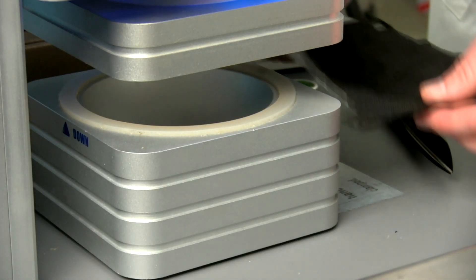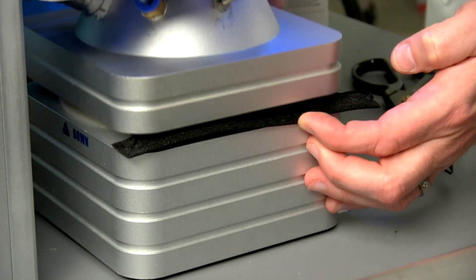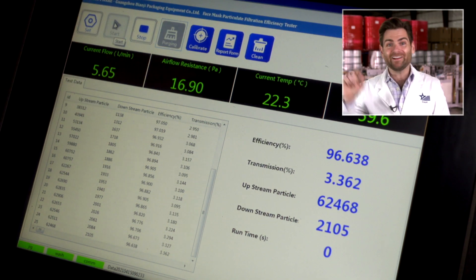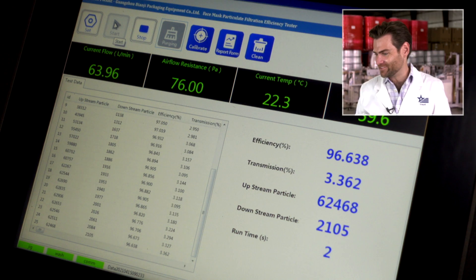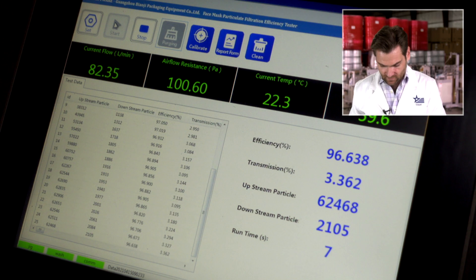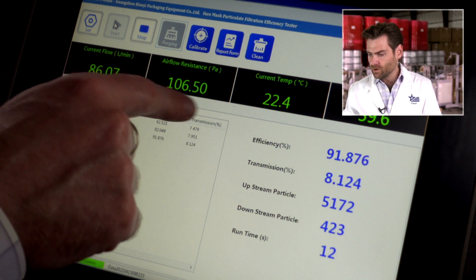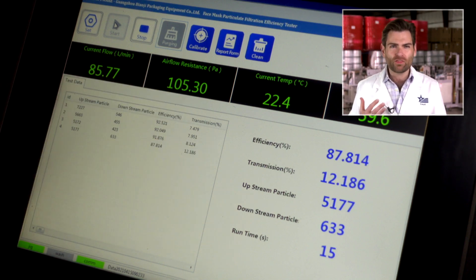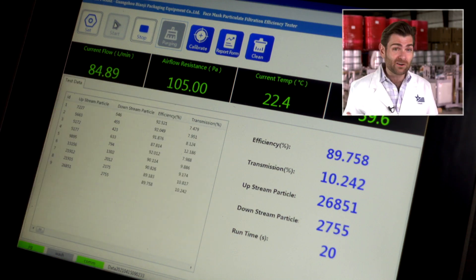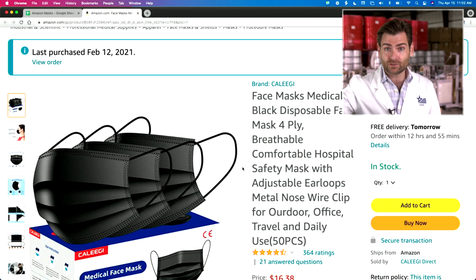Everyone loves this part — it's where I see if I can catch my finger. Got it a little bit there, let her rip. The machine's warming up, clearing stuff from the previous test, and I'm looking at the airflow resistance. You want this to be under 150. Our masks are typically about 130, which is actually pretty high, but anything over 150 and you're not going to be able to breathe for long. We're reading 104.9 — 105. That's really, really good.